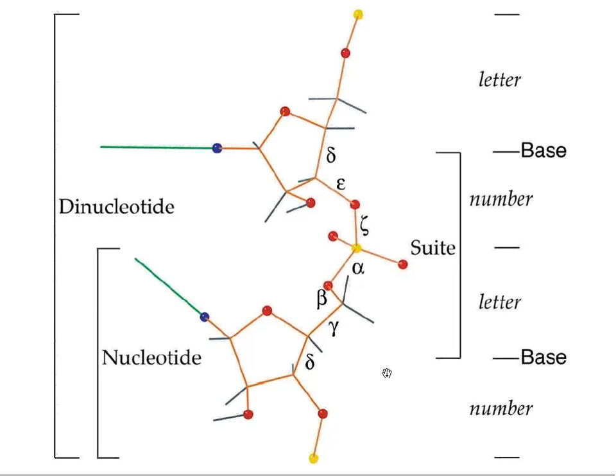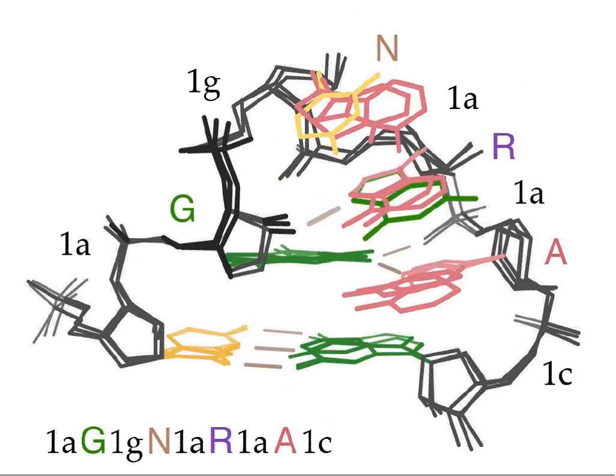An RNA backbone, for the most part, is pretty rotameric or conformeric. It has barriers between most of these conformations. And so we end up being able to name a structure by putting this 2-character identifier for the backbone conformation in between the base identities. And with this plus base pairing, you have a very complete description of the structure.